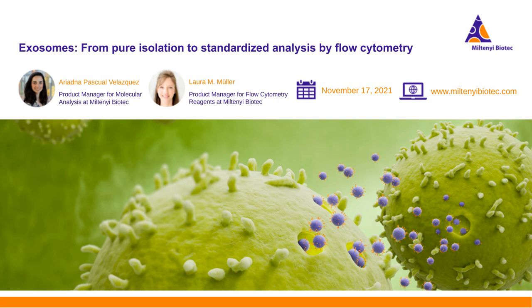Thank you very much. Now, what do you think about aldehyde sulfate latex beads for analysis of exosomes by flow cytometry? So these beads are a perfect tool to analyze single markers on the vesicles. You basically non-specifically bind the vesicles to the beads, and this allows you again to use standard flow cytometry to detect the markers on the vesicles. However, as said, the binding to the beads in this case is a non-specific binding. So you of course cannot be sure what you have captured on your beads.